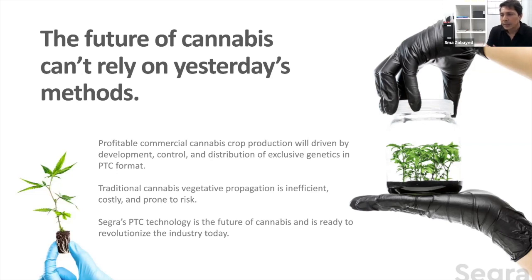Unless you take the plants out, grow them, and find out they are producing something different than you expected, you probably cannot say whether it's clonal variation or not. However, in tissue culture, if you're familiar with your plants, you can sometimes see that some plants look different, either not doing as well as your regular batches. But that's very rare, because sometimes plants that are genetically the same may behave differently in one transfer for different reasons.